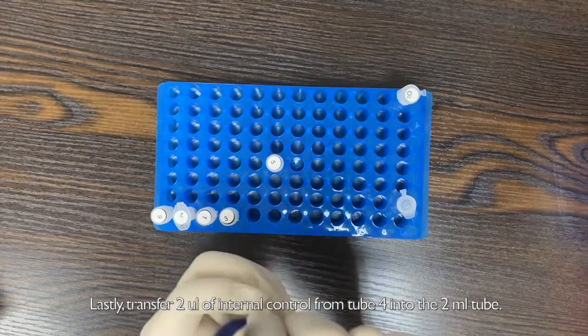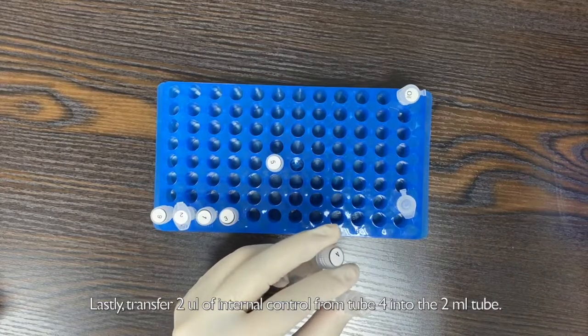Lastly, transfer 2 µl of internal control from tube 4 into the 2ml tube.